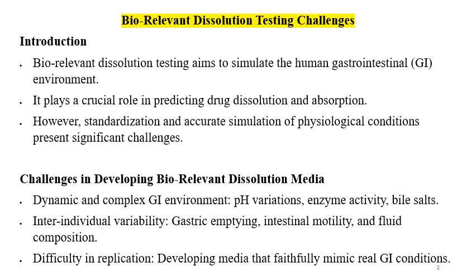Then we can also simulate the gastric emptying time, the motility of the GI, and the composition. But it is not that easy. It becomes very challenging. So the main challenges in GI simulation are related to biorelevant dissolution testing challenges. Let's start one by one.